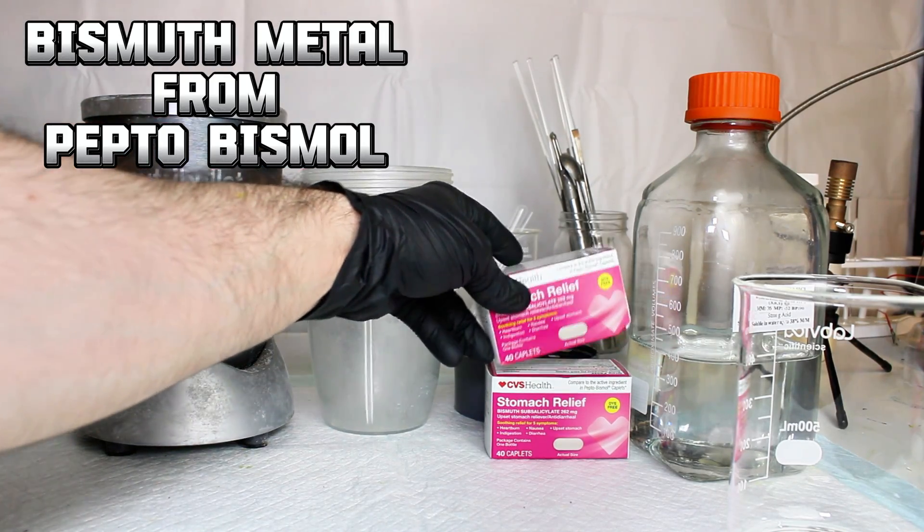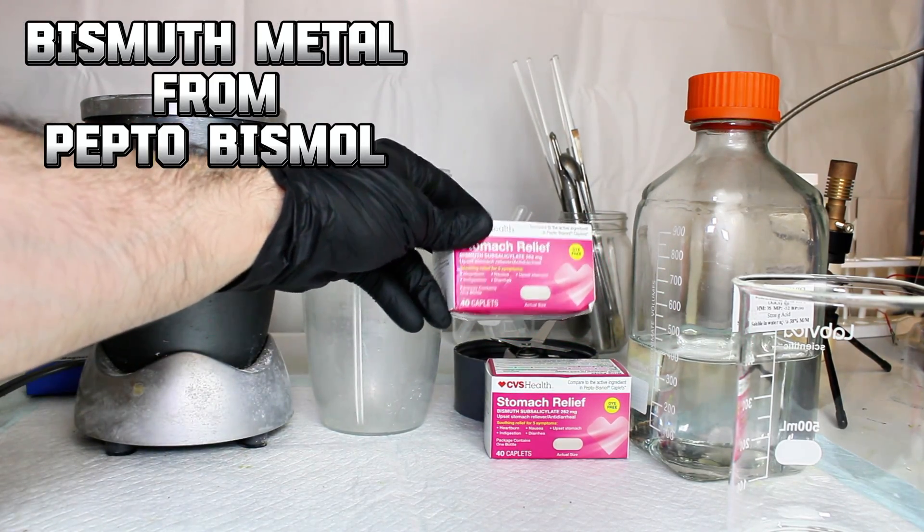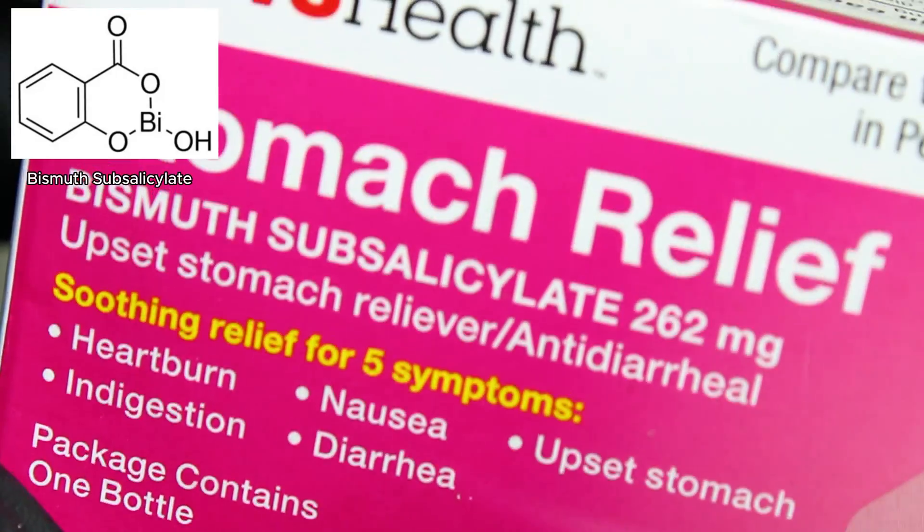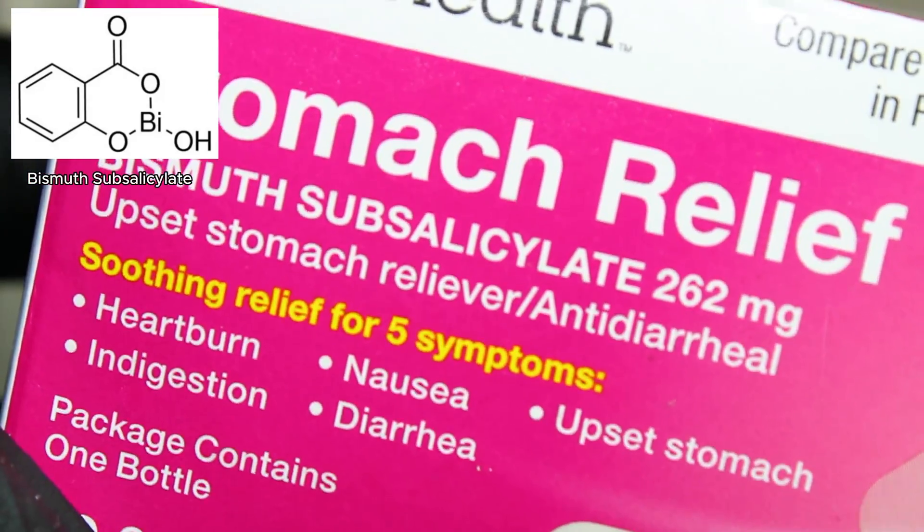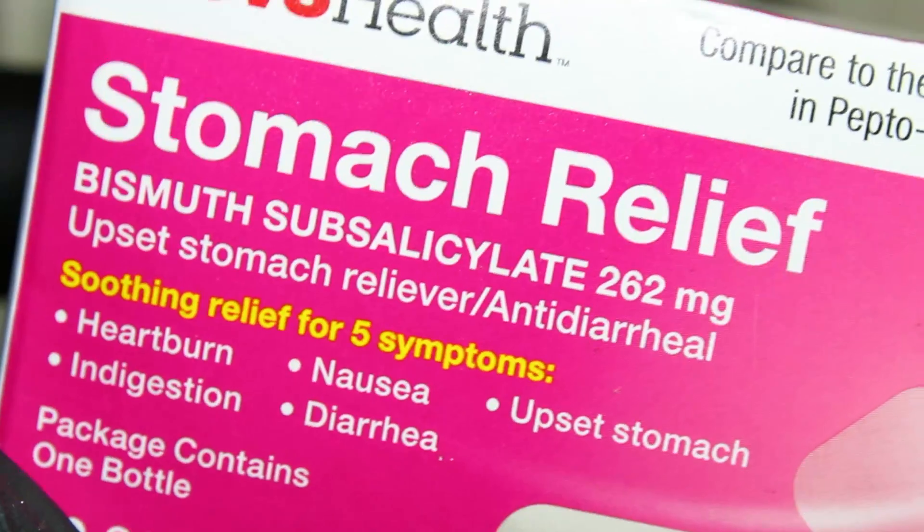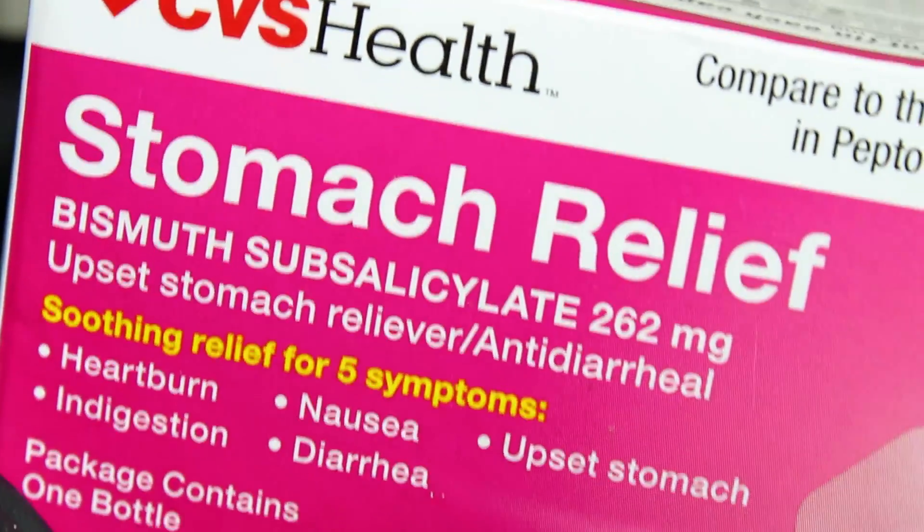Pepto-Bismol is the brand name for an antacid medication containing the chemical bismuth subsalicylate. Bismuth subsalicylate is made by the hydrolysis of bismuth salicylate, which is simply ionic bismuth bound to salicylate.